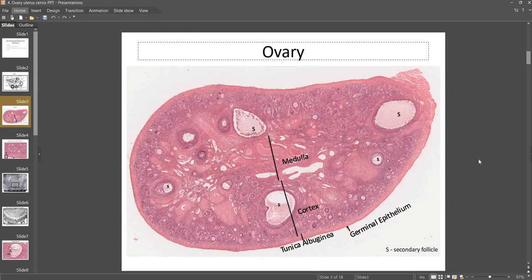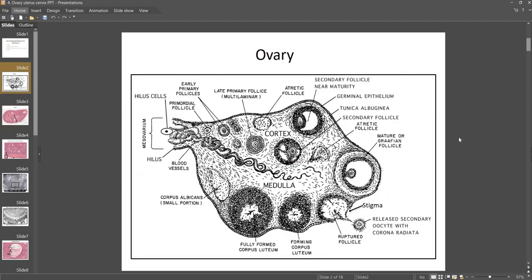I'm going to review the different ovarian follicles, but before we do that let's go over the different layers of the ovary. On the outside, the ovary is surrounded by germinal epithelium, which is a simple cuboidal epithelium. Just deep to that we have connective tissue, which is the tunica albuginea. In the middle of the ovary we have the medulla, which is where all the major blood vessels are, and all the follicles will be in the cortex.